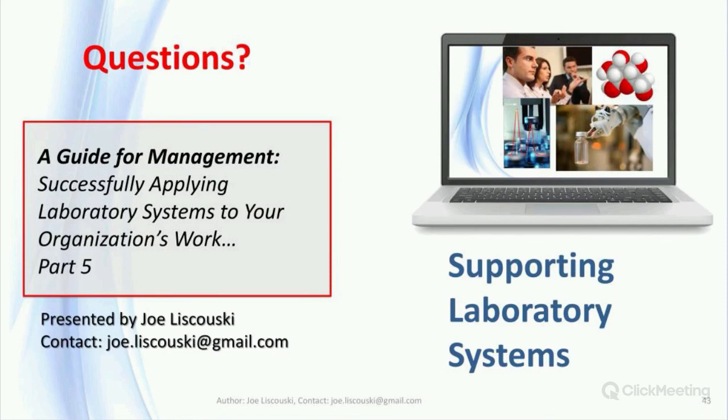Yeah, that's pretty much the typical problem. Lab systems are diverse. They're usually not Windows based, or not always Windows based. You'll find Unix and other operating systems out there. The problem is to start at the point of purchase. Make sure people understand what's going on.